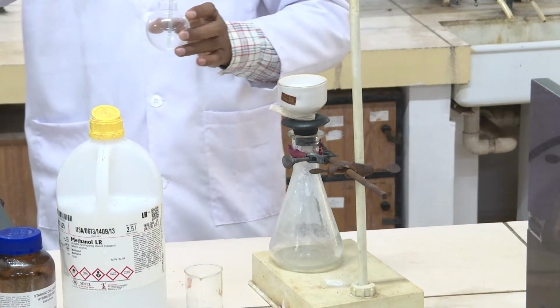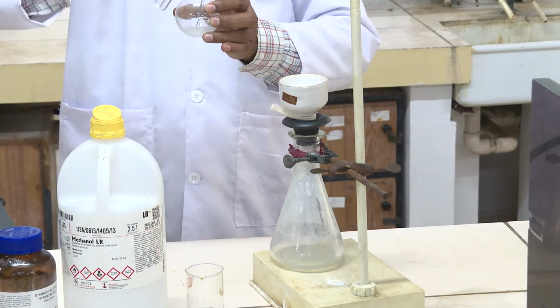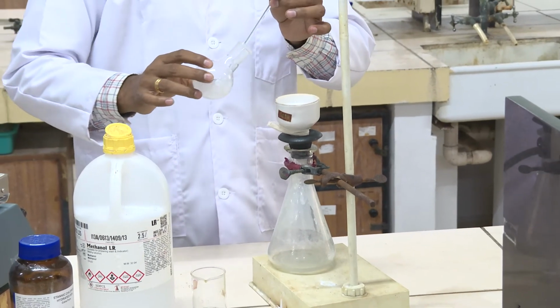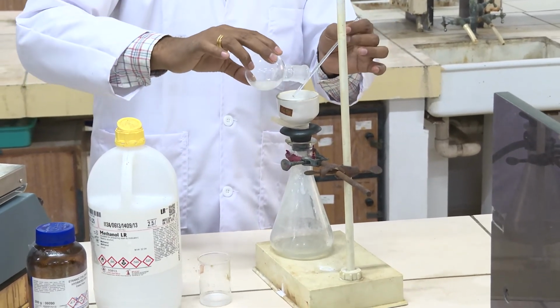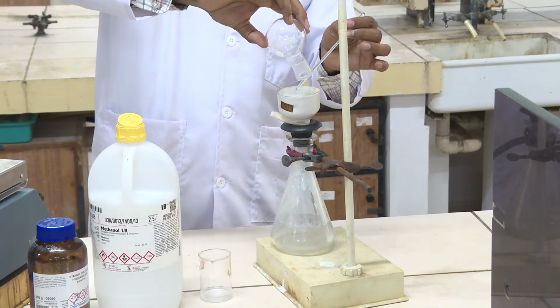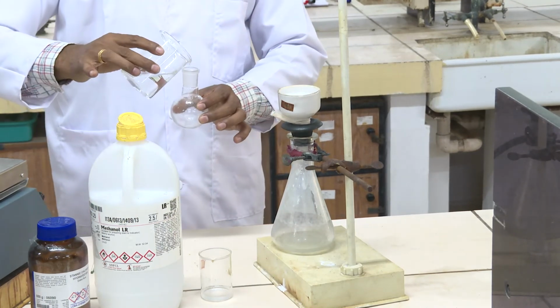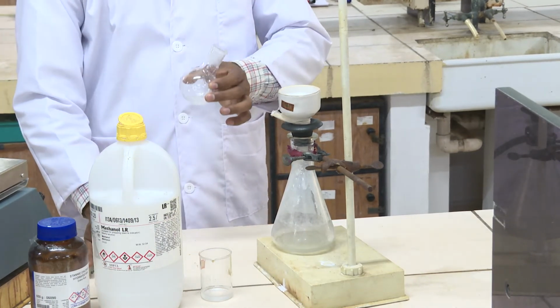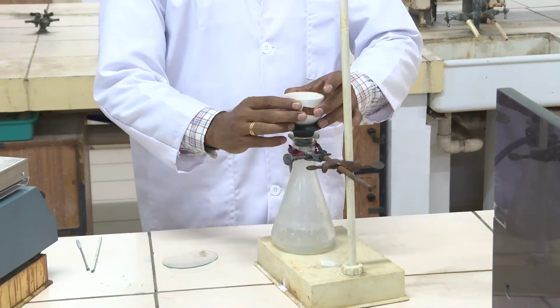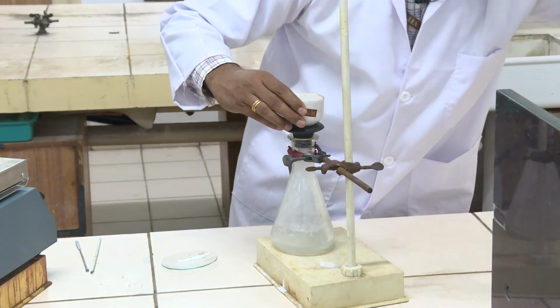I am going to add more methanol to transfer the entire material, and moreover it assures complete washing of the material. After complete filtration, now I am going to switch off this vacuum pump.